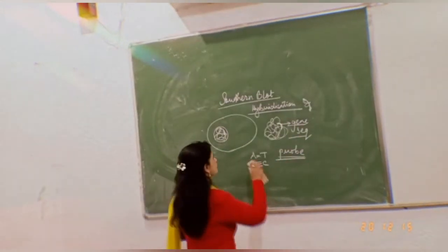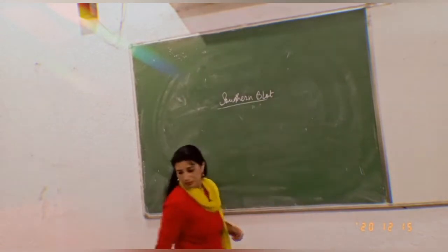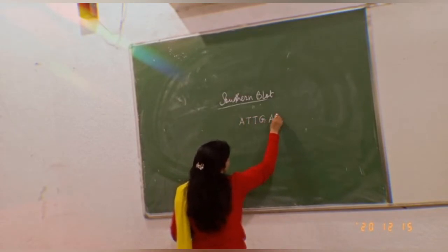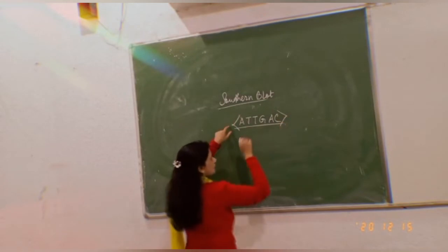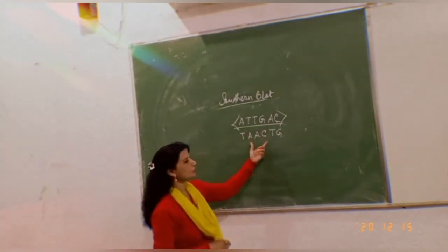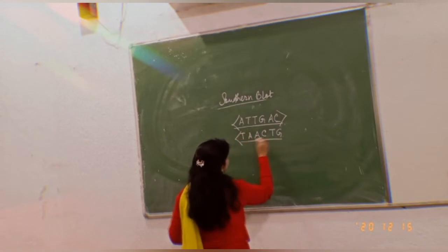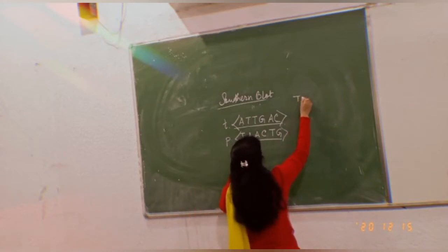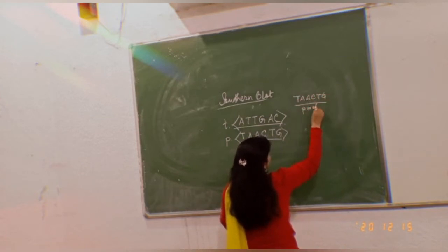Suppose I know my target gene sequence as ATTGAC. Now this is my target. I have to prepare its complement, and the complementary base pairing rule says if it is A, start from here. I have got my complementary bases prepared. That means this is a probe for me. This is my target, and this is my probe, which I will use later. So let me write it: T A A C T G. This will act as a probe for me later.